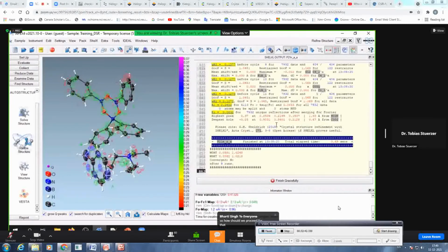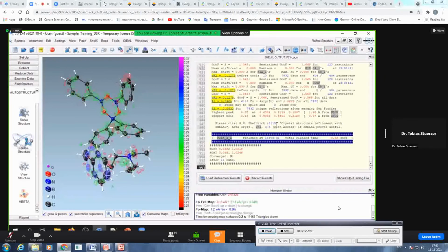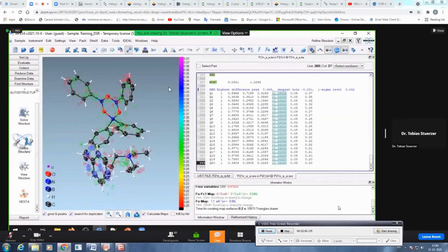What I usually try to do is, if I see the hydrogens, so if I see the density, I refine it. If I do not see them, I do not refine them, because then it's just vicious, to have no indication where the protons are. If I see them, then I never refine the hydrogens freely. I always use DFIXes and DANGs if necessary.